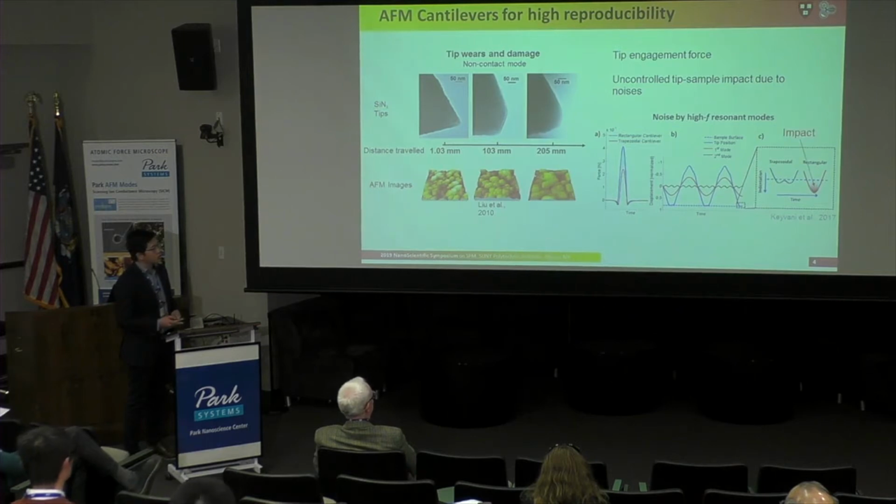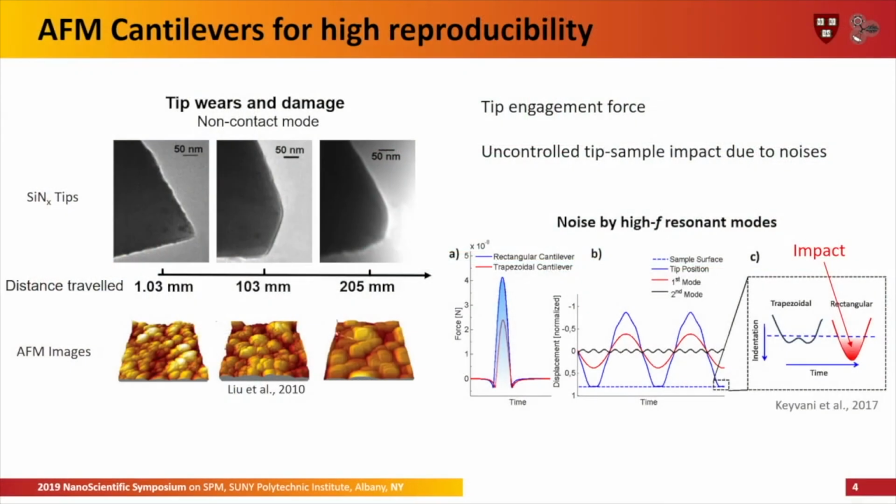And in every single cycle of scanning, the tip will contact the substrate and create potential wearing problems.